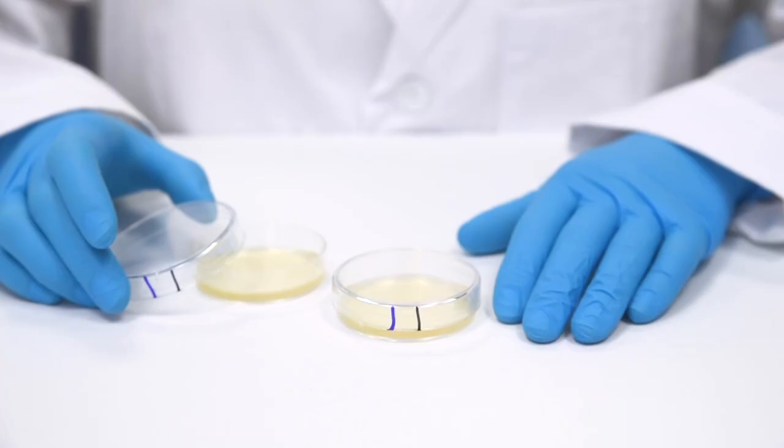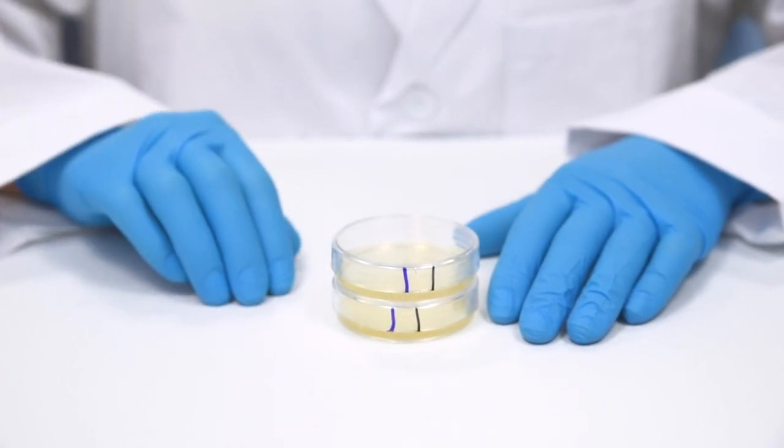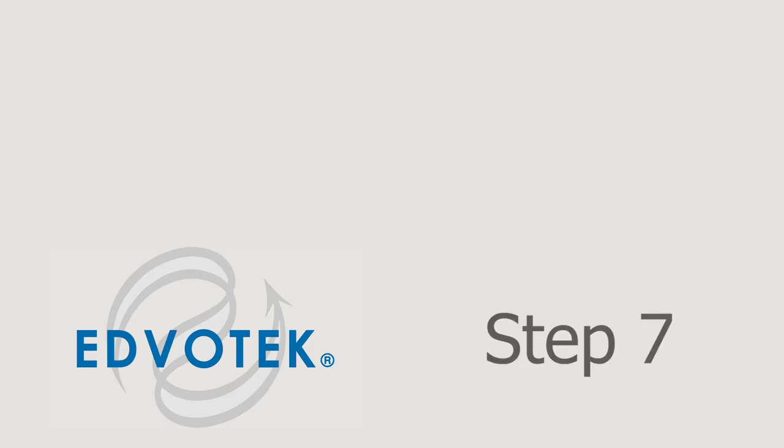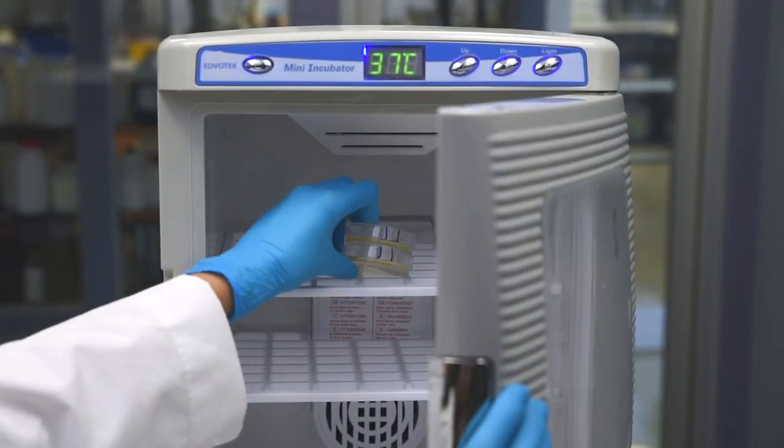Step 6: Replace the cover onto the plates. Step 7: Incubate the plates inverted in a 37 degrees Celsius incubator overnight.